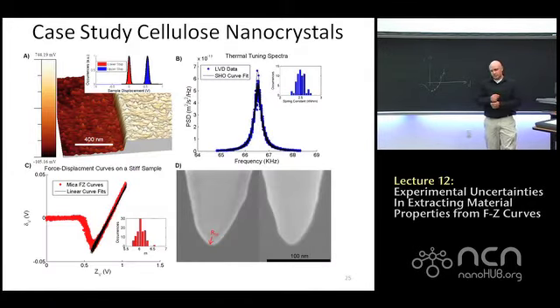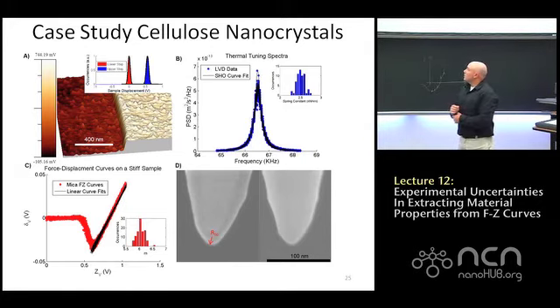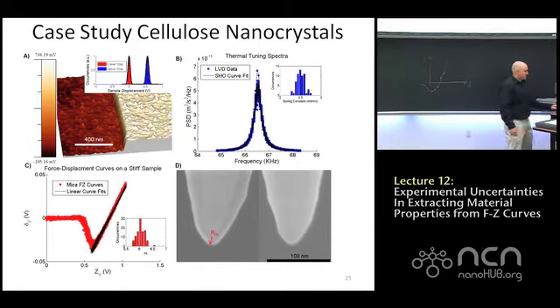So, what are the uncertainties in the inputs? This is just an example for 4 of the parameters, specifically CZ, KL, and M, because I'm trying to make them independent. So this is just a step height measurement of a sample that we know the height is 8 nanometers plus or minus 1.5 nanometers.